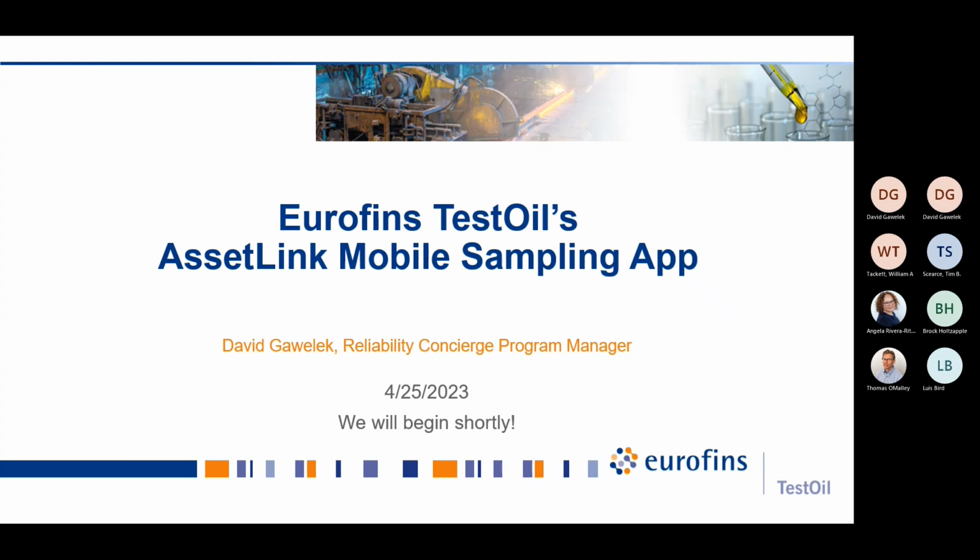We wanted a tool that kind of works within a process, and the process is your greater reliability program. We wanted something to complement our program web portal data site. So there's some pieces that work in conjunction with data site, in addition to all the standalone features.